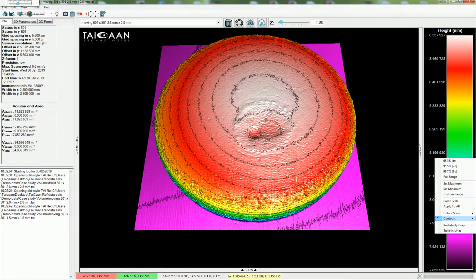We can see that the contours here are showing us that the top of the surface has a domed characteristic, so some sphericity associated with it, and in the central region you can see the region where the arc erosion has taken place and damaged the surface. I think it's fairly clear if we take a top-down view of this. Let's just zoom in. What we need to do is determine the wear relative to a datum surface.